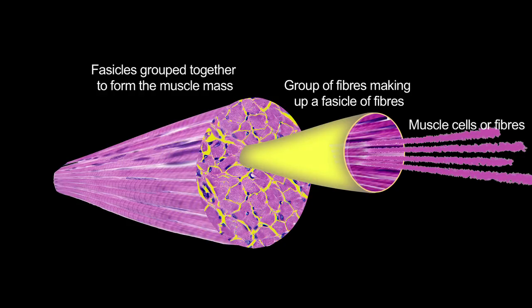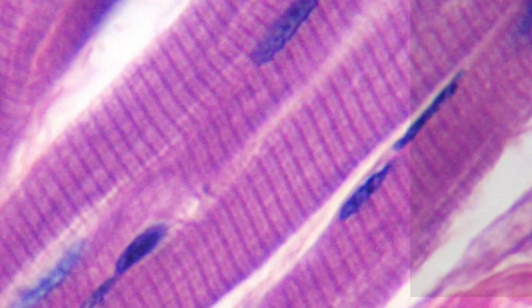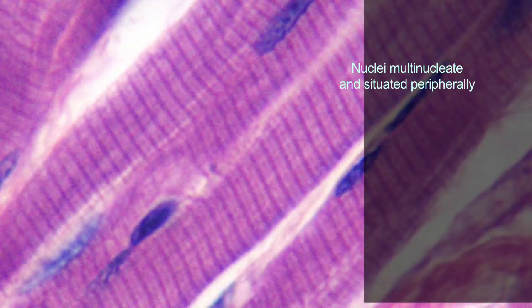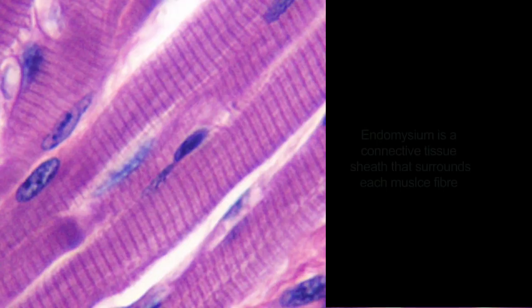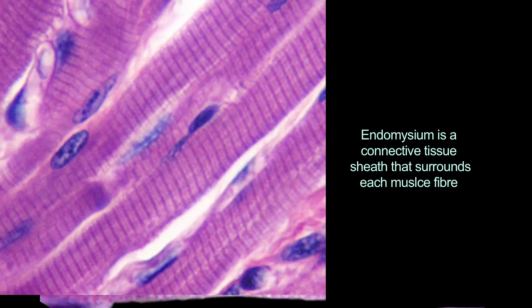This is a transverse section of a mammal tongue to demonstrate skeletal muscle. First, we will examine the longitudinal section of muscle fibres. Skeletal muscle is multi-nucleated, that is, there are more than one nucleus per muscle cell. These nuclei are elongated and arranged peripherally along the muscle fibre. Each muscle fibre is enclosed in an endomysium, which is a connective tissue sheath.